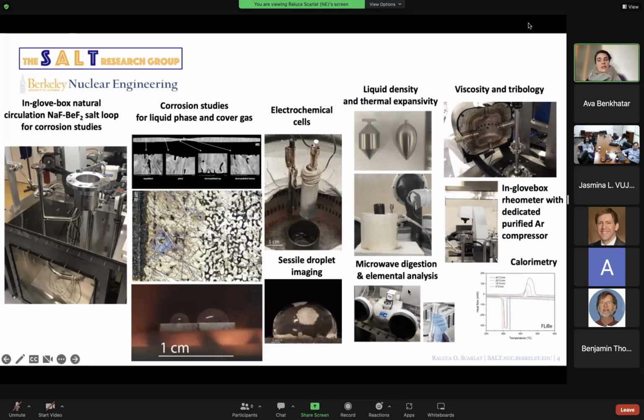Step 2 of elemental analysis is digestion. So we do elemental analysis by ICP techniques, ICP-OES or ICP-MS, and the input into these instruments are highly dilute aqueous acidic solutions. So we need to go from 50 milligrams of salts to 50 milliliters of an aqueous digest, and we do so with microwave assisted digestion, and that entails bringing a series of acids at controlled pressure and temperature over a period of time, and so that facilitates digestion, and then that digest, which is what you see here, is analyzed by ICP-MS.